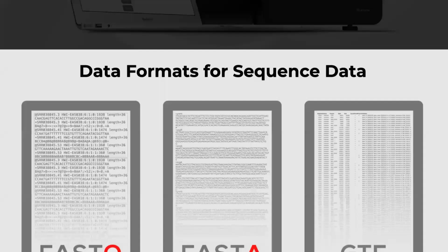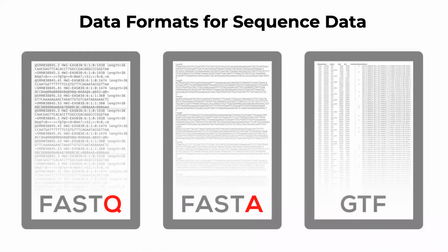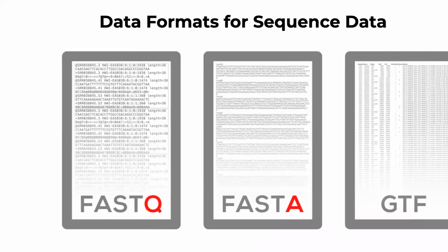Now, the information for next generation sequencing is stored in these three types of files. Typically in a pipeline called RNA-seq, or if you're doing whole genome sequencing, you will also use the same kinds of files. Basically, the read information is stored in the FASTQ files. The reference genome is stored in the FASTA and GTF files.